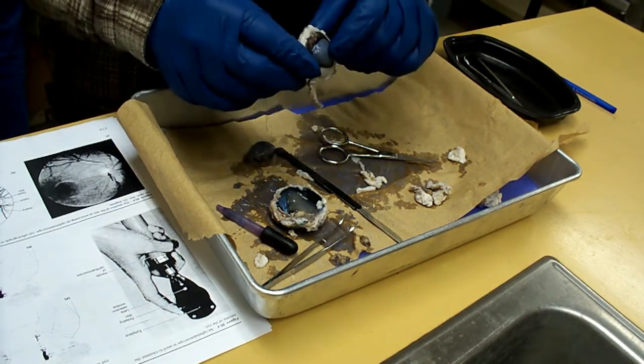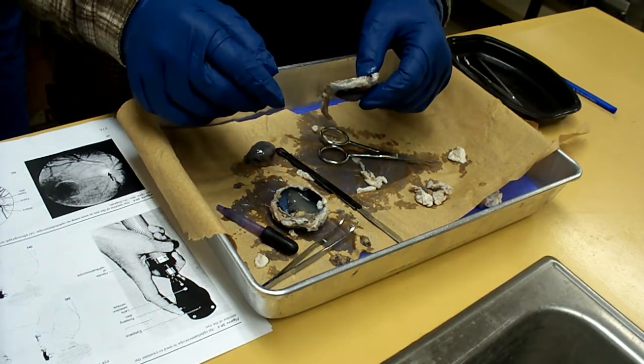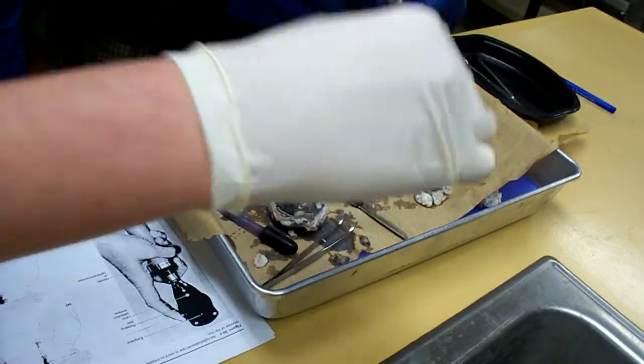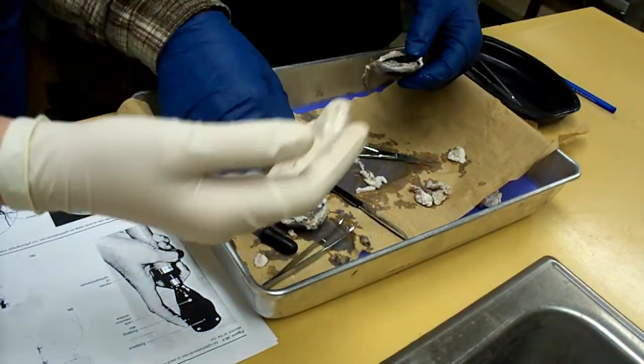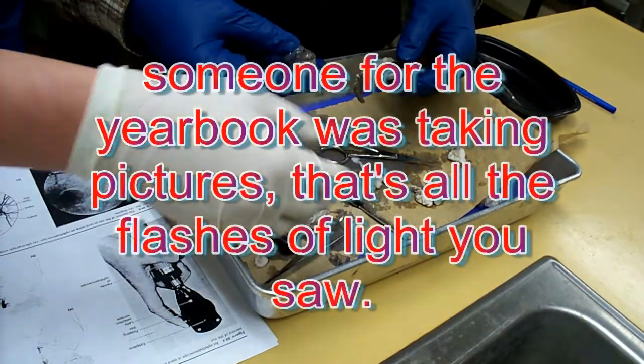How many of you have a vitreous humor attached to the lens though? Go ahead. Feel that. That's disgusting. All right. That's kind of cool. We're going to do a group shot.